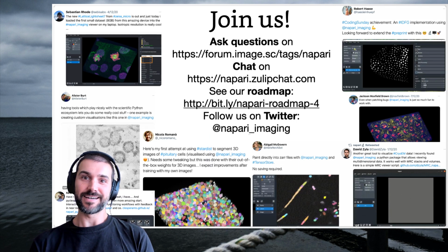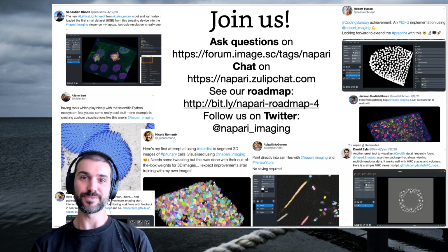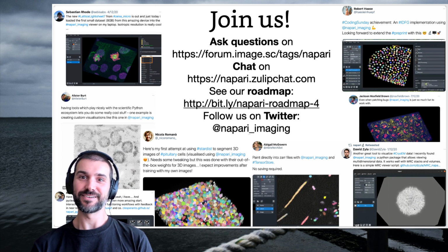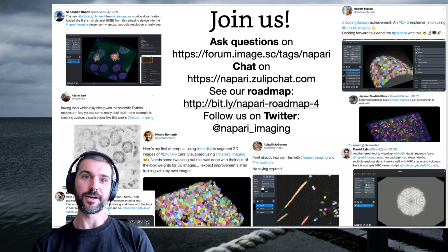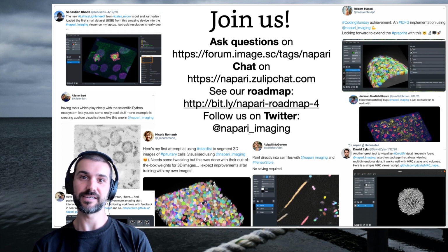And so lastly, I would just ask you to join us, and there's lots of ways for you to join us. The Napari Twitter is a great place to get inspiration for how people are using Napari. You can see there's just all kinds of cool stuff happening in the ecosystem now. Again, you can ask questions on image.sc. We have a chat room that anyone can sign up to publicly.